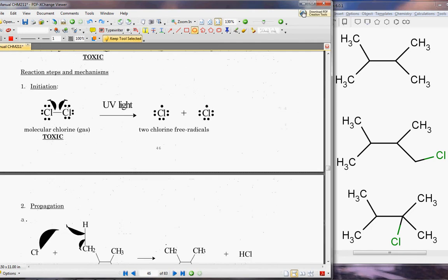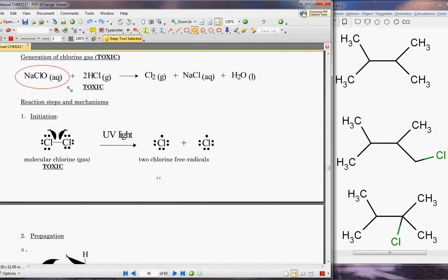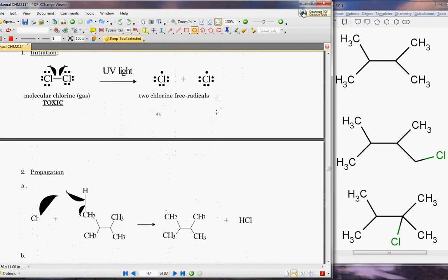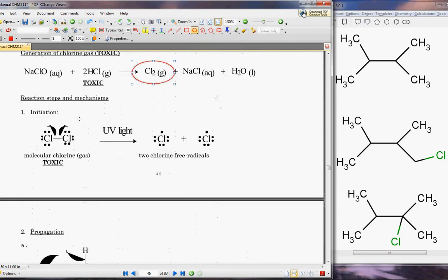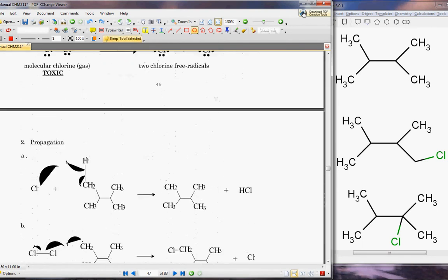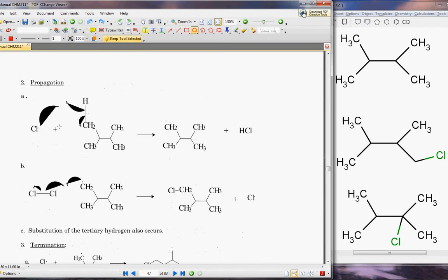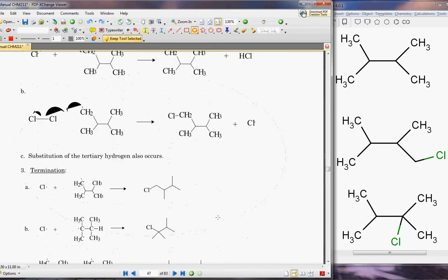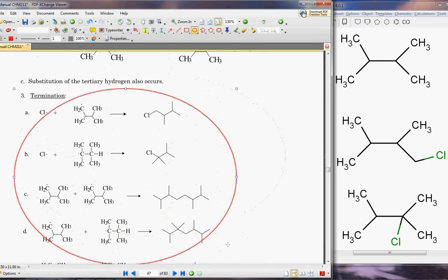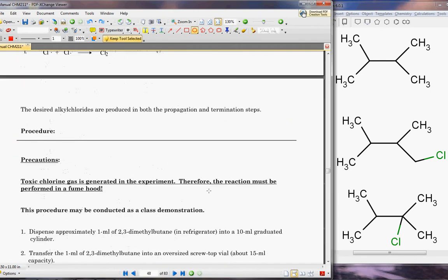This week we're going to use bleach, which is written here as sodium hypochlorite, and we're going to use hydrochloric acid. This is going to produce the toxic chlorine gas and salt and water. After we form the chlorine gas, we're going to use UV light to start our initiation step. Then our propagation step is shown, and then our termination step is also shown.